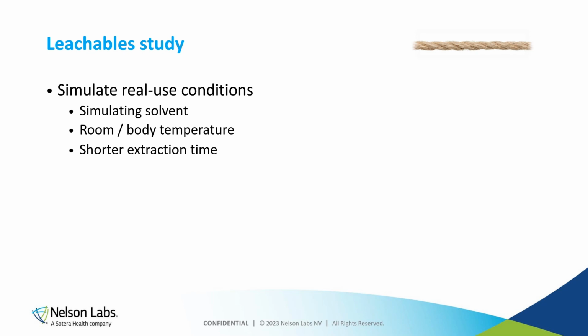When you have contact with wounds, you can use saline to mimic sweat in combination with 40% ethanol in water to mimic blood. If you have contact with certain drug products with certain pH, you can use water at that pH in combination with a binary mixture. So a certain percentage ethanol or isopropanol in water to mimic the organic content of your drug product.